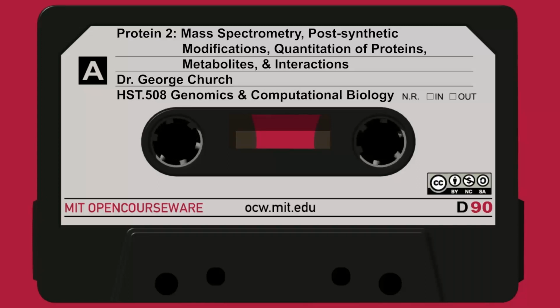And so you'll see the things that go absolutely the fastest in the cell, and among the most abundant are the ribosomes and the ribosomal subunits. This is done under conditions where you just tease apart the two ribosomal subunits so that they're separated. And the bigger of the two is called 60S. S refers to Svedberg, who was one of the pioneers of sedimentation velocity. And this can be correlated, the rate at which it goes down this stabilized gradient of centrifugal field is related to the complex.